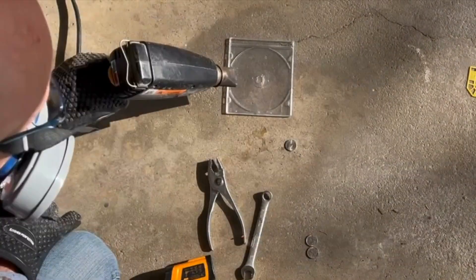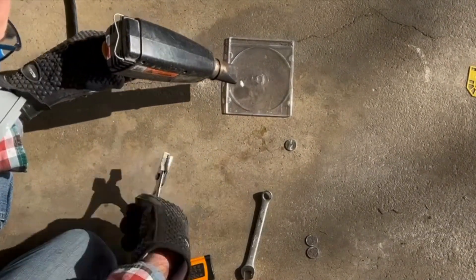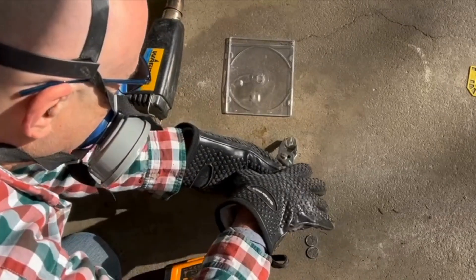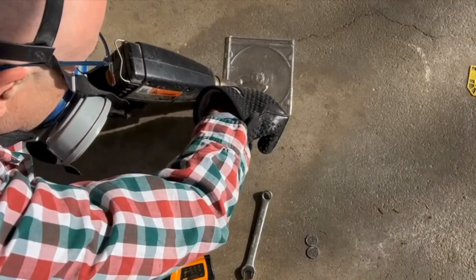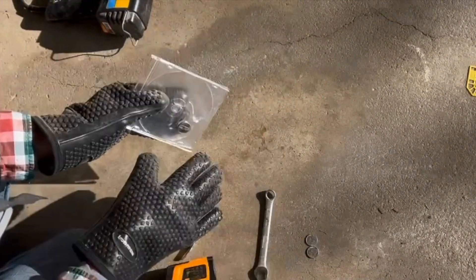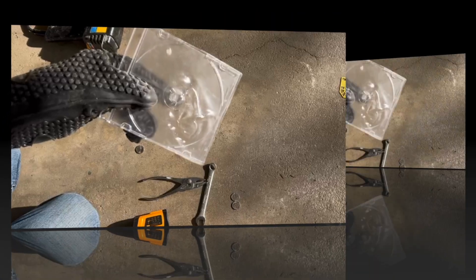Let's heat this second object to see if it's a thermoplastic as well. It is starting to flow like a liquid as I heat it, and I am able to reform it into a new shape. This also seems to be another thermoplastic.